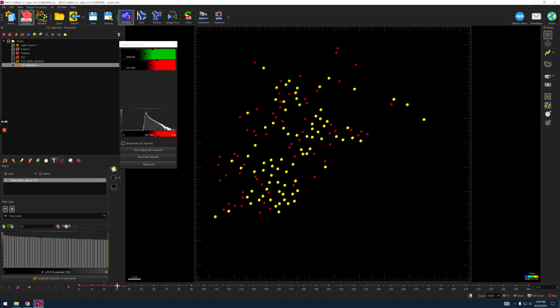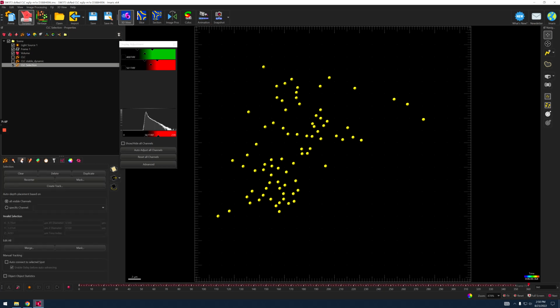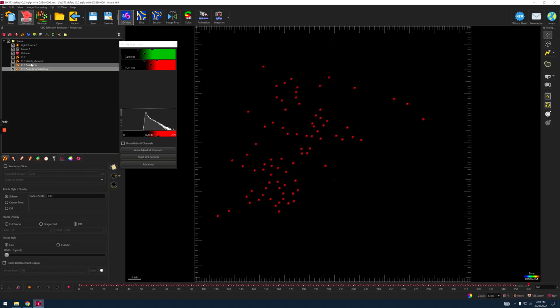You can see that everything that is highlighted in yellow are the stable CLC tracks that never disappeared at any time point. They are just always there. Okay, so this is the Clathrin light chain stable tracks that we want to select. And now I go to the pencil and just duplicate. So the Clathrin light chain selection, this is the stable channel that you want. So I'll rename it to be CLC stable.